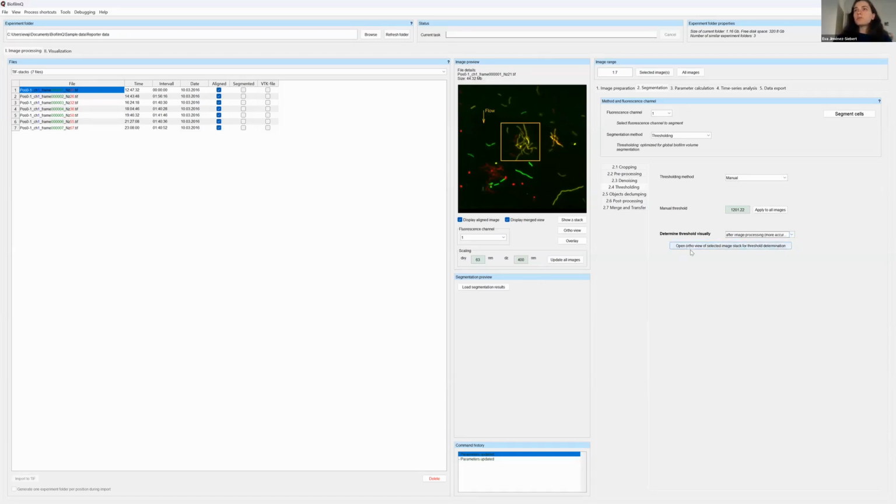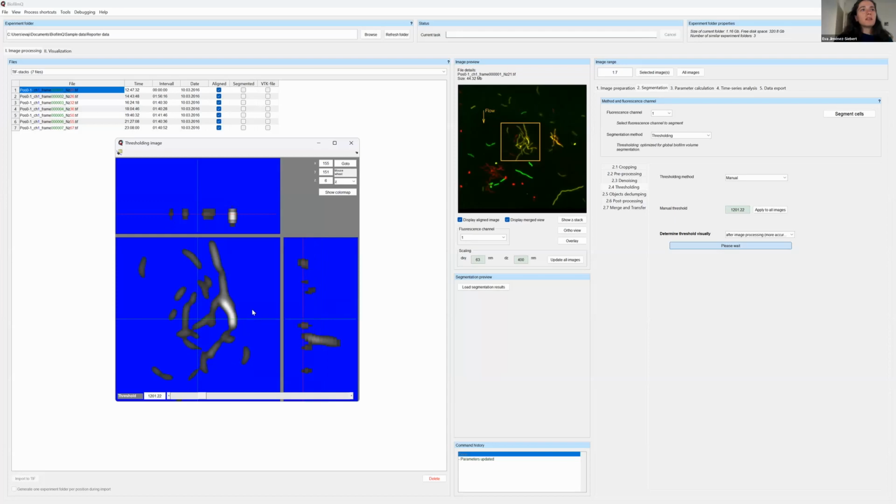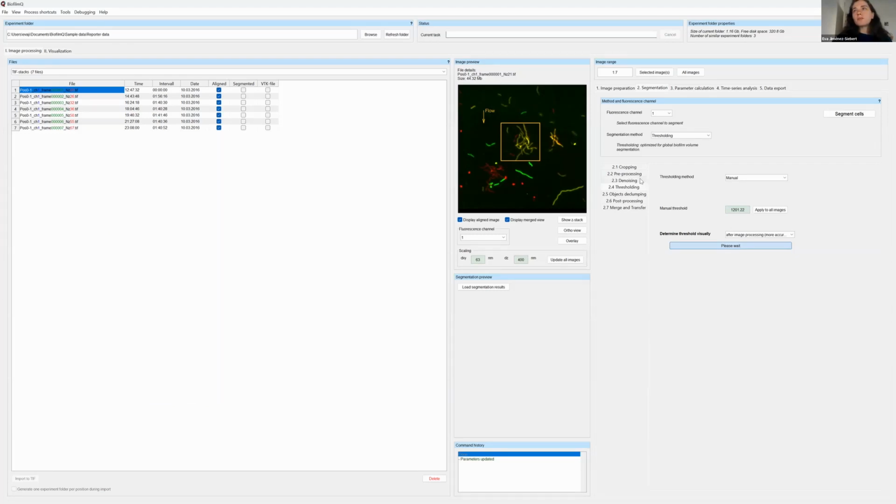And now this is the point where we can see what effect these filters have on our segmentation. So we can, for example, choose to make this filter here bigger. We can do the XY filter, for example, 13 pixels, and we can click this again, and then we can see that the image looks much blurrier now, even so blurry that it's too blurry for what we want to have. But you can then also go back and put the filter size back to how it was.